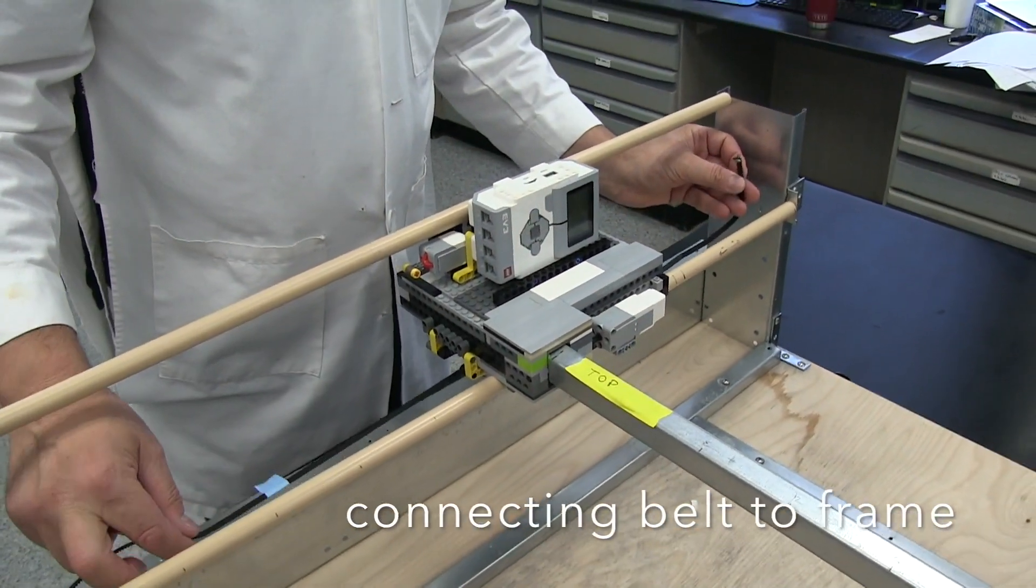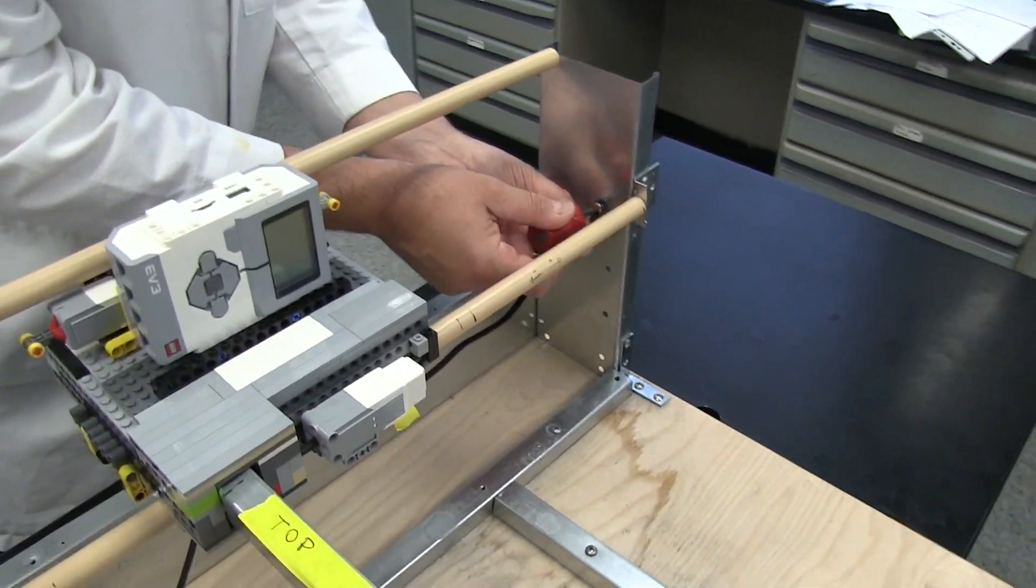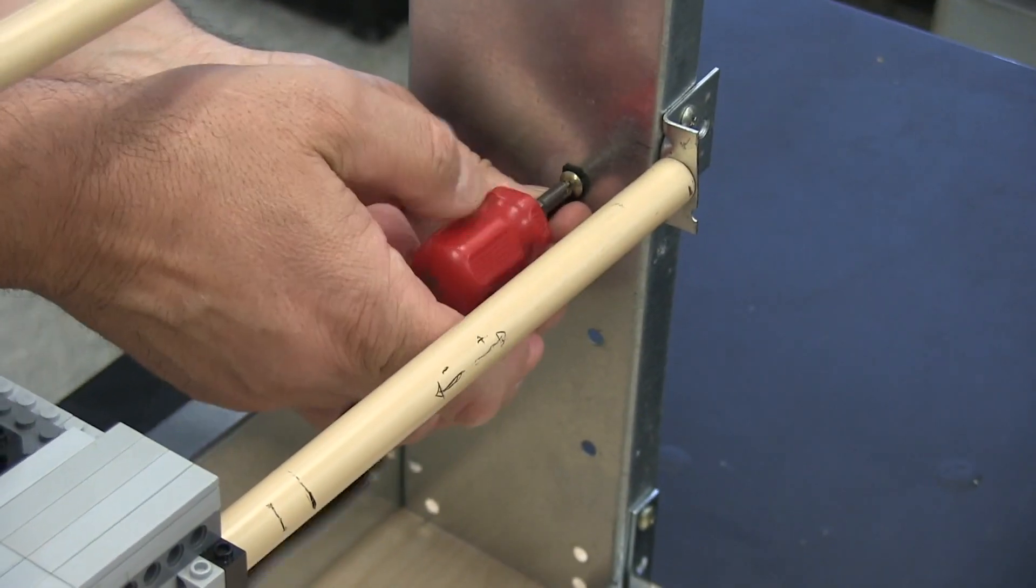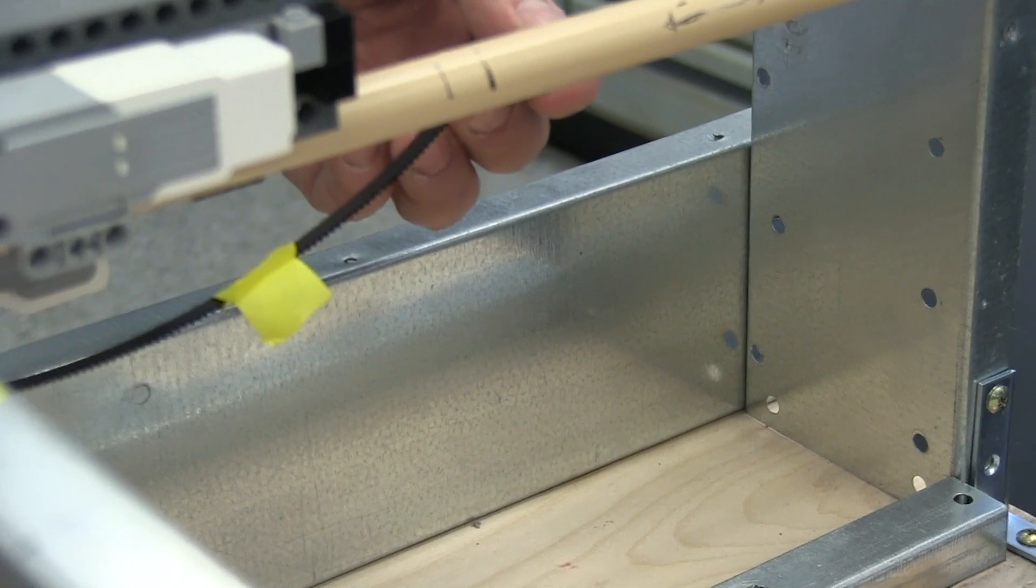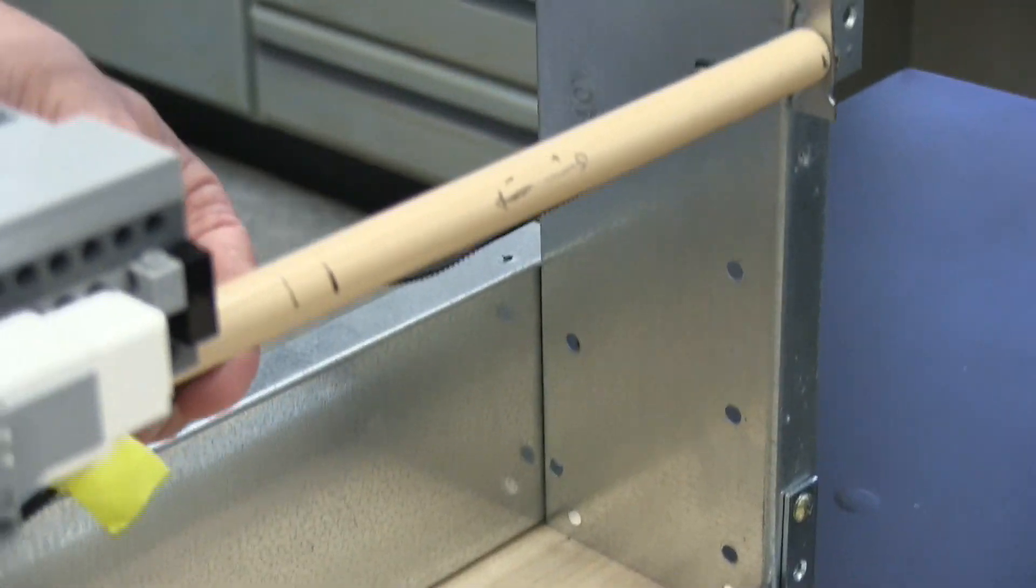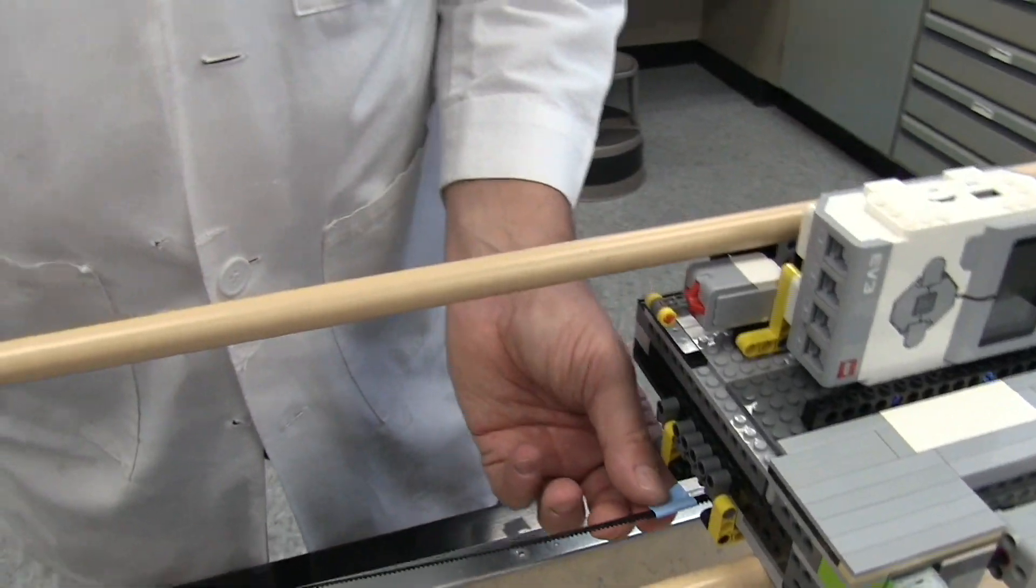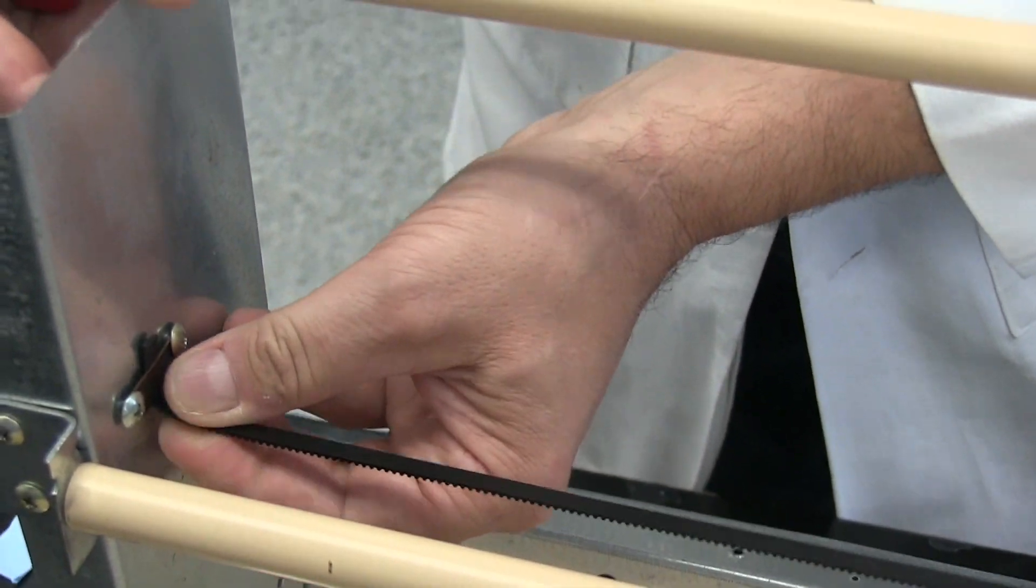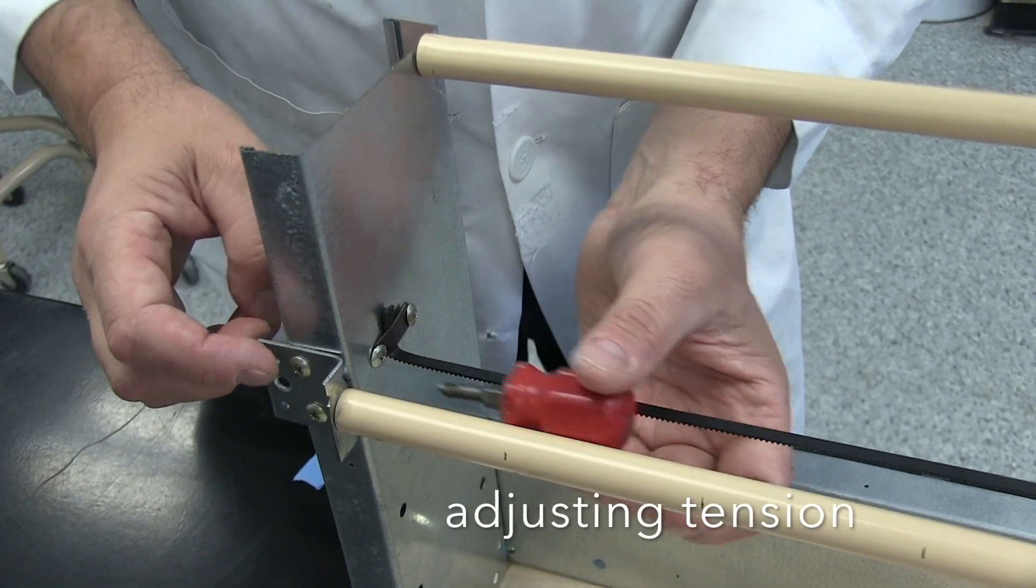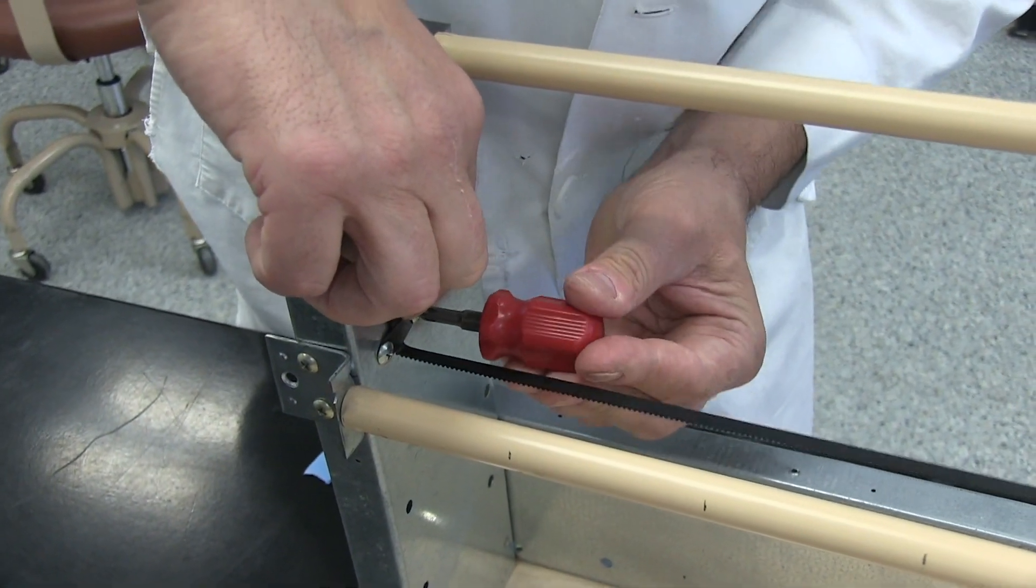At this point, we will attach the belt to the frame and it will be fixated on one side with a screw. The other side of the belt will be fixated through a tension device. This is created by linking two screwed pieces together and then tightening the screws to meet the required tension.